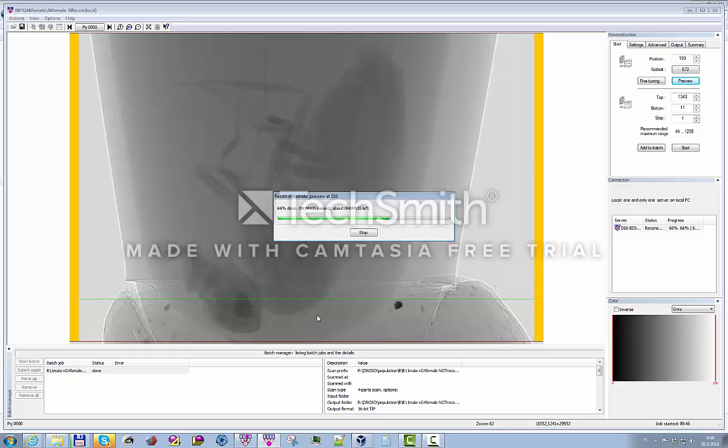You can only compensate some types of misalignments. If, let's say, your individual is half dead, half alive, and it has moved while scanning, this is not possible to correct, just because the software doesn't know the position of, let's say, a leg before it has moved. So in this case, if something has moved during the scan, you would need to scan it again. That's the only option.